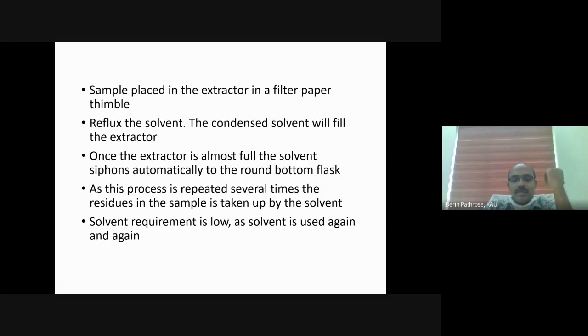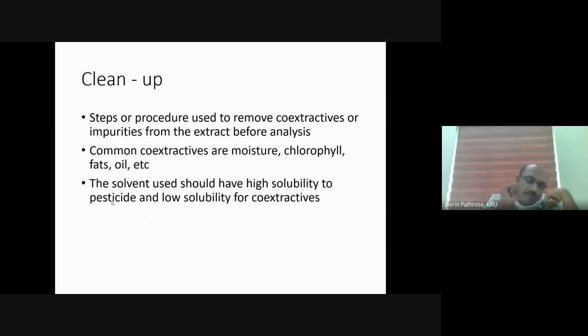This process is repeated again and again. As I told you, the solvent requirement is low. This is mainly used for extraction of pesticides from spices and cereals. Though we have certain other quicker methods also, for certain spices this is the method which we use.